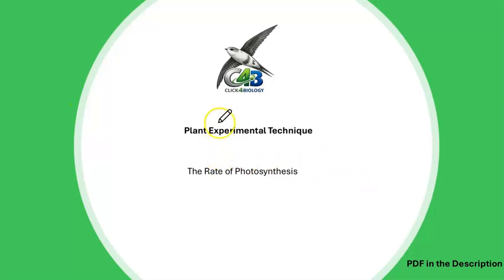We're looking at plant nutrition and in particular at plant experimental techniques. In this particular video, we're going to be looking at a technique which is used to measure the rate of photosynthesis.